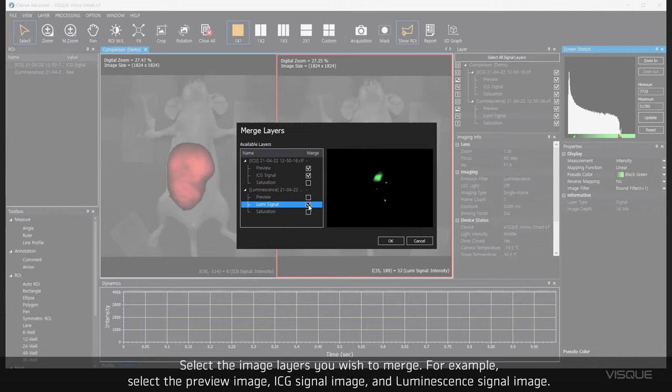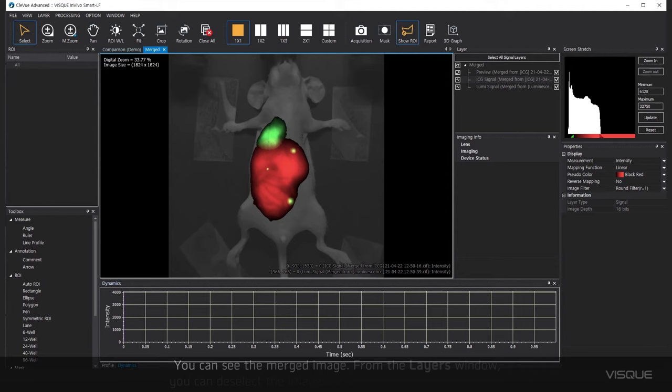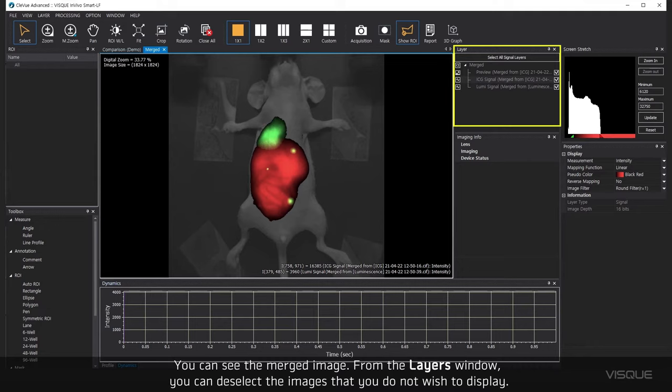You can see the merged image. From the Layers window, you can deselect the images that you do not wish to display.